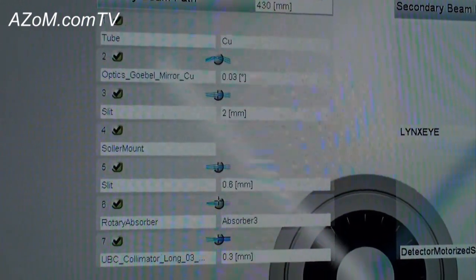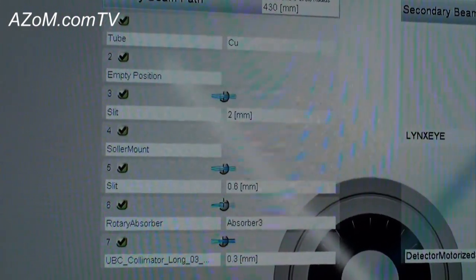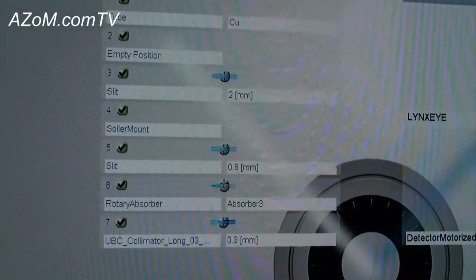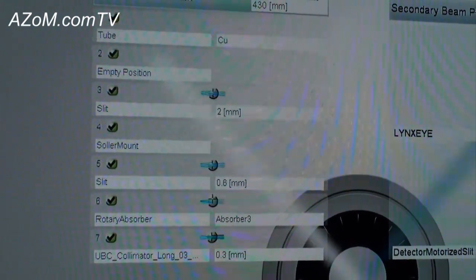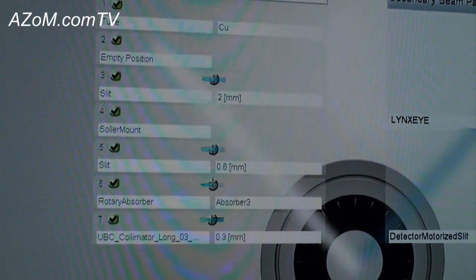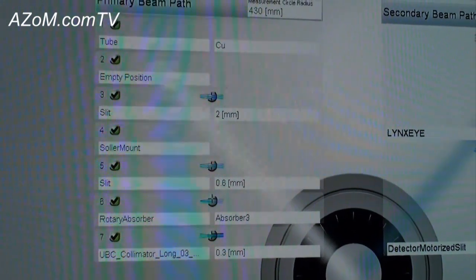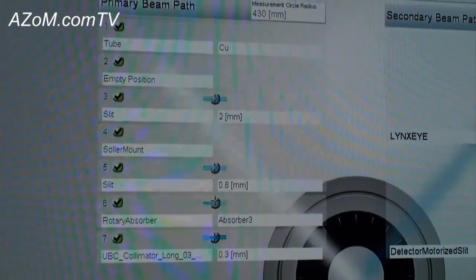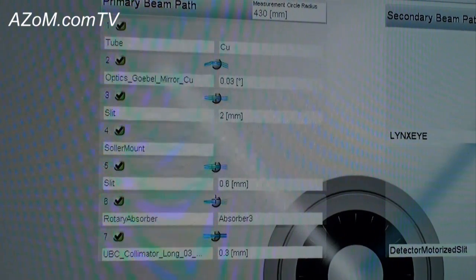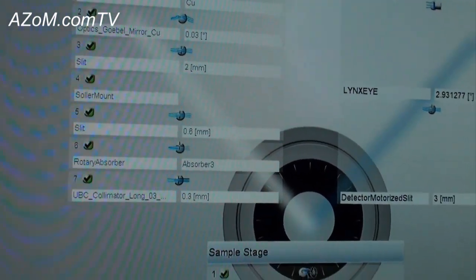I'll take that optic off one more time and you'll notice that that switches to an empty position. So the system knows now that that optic is no longer mounted. I go ahead and mount that back to the system and it recognizes, again, Göbel mirror with copper radiation.